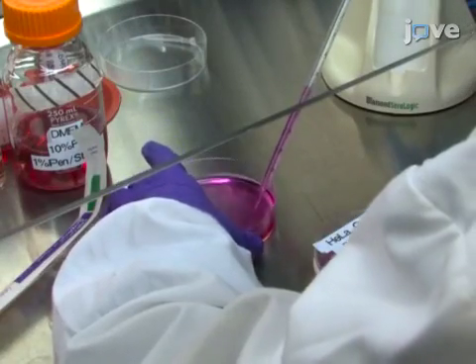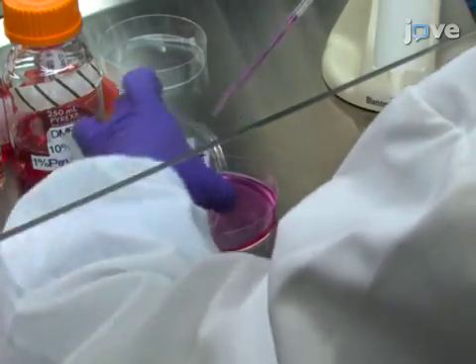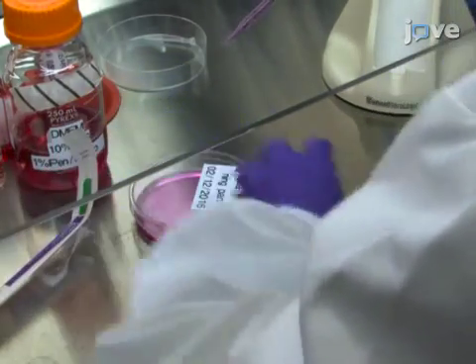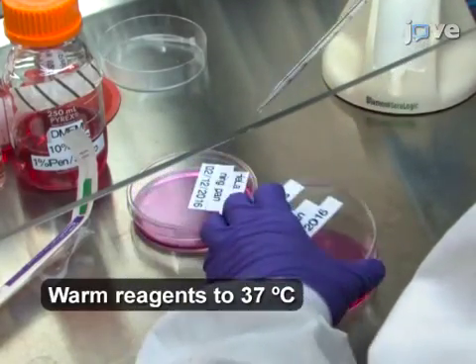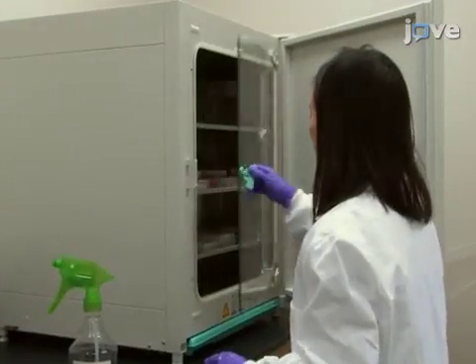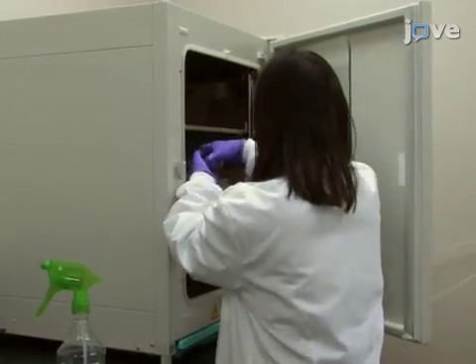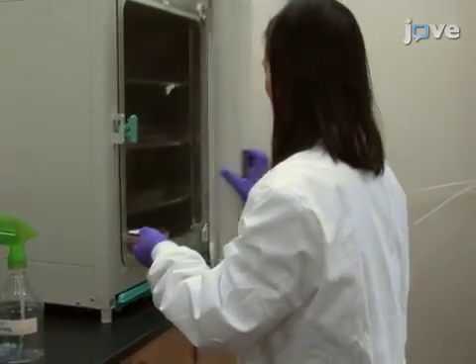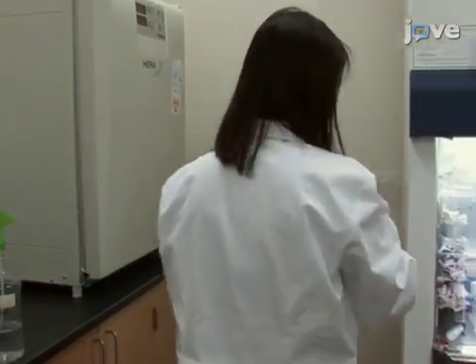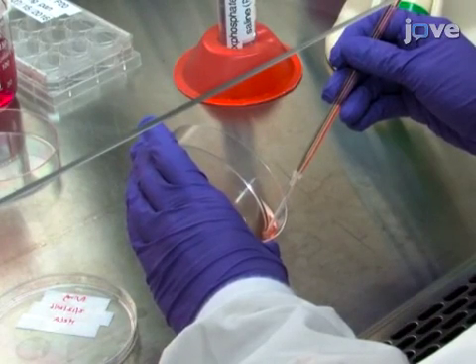Obtain a cell sample, such as 1 milliliter of HeLa cell suspension, and add it into 9 milliliters of complete cell culture medium in a standard 10-centimeter cell culture plate. Keep the cells in culture at 37 degrees Celsius with 5% CO2 for 2 to 3 days until the growing surface is covered at 70 to 80% on the cell culture plate. Perform cell passaging in the cell culture plate.